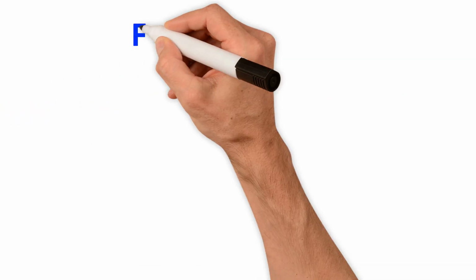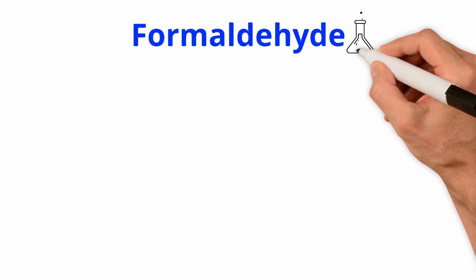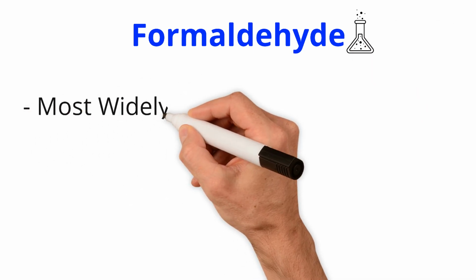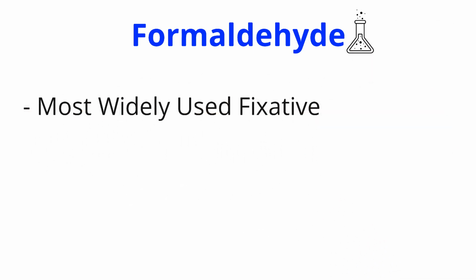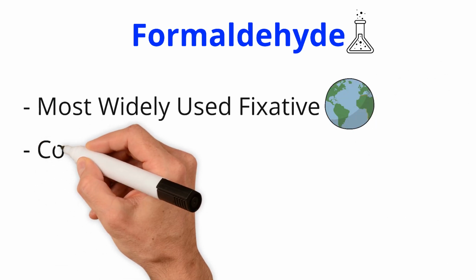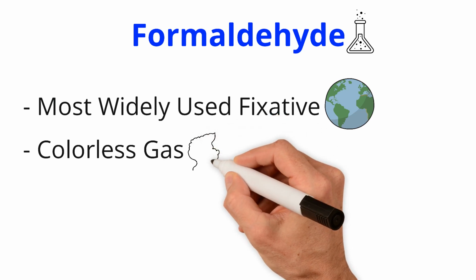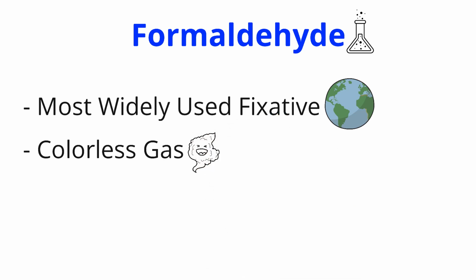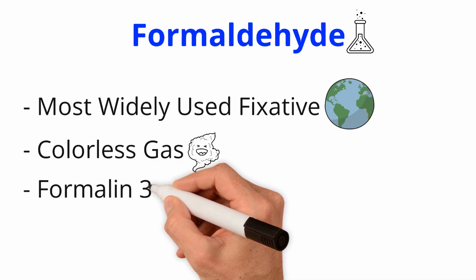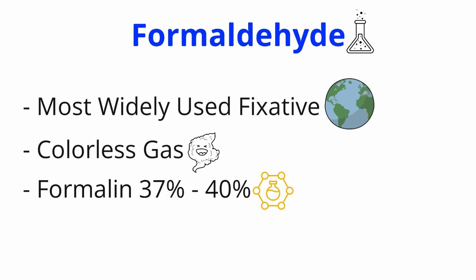Formaldehyde is the most widely used fixative in laboratories today. Later on, I might need to dedicate an entire video to it, but for now, here is a brief introduction. Formaldehyde is a colorless gas commonly supplied in labs as a 37% to 40% solution in water, known as formalin.